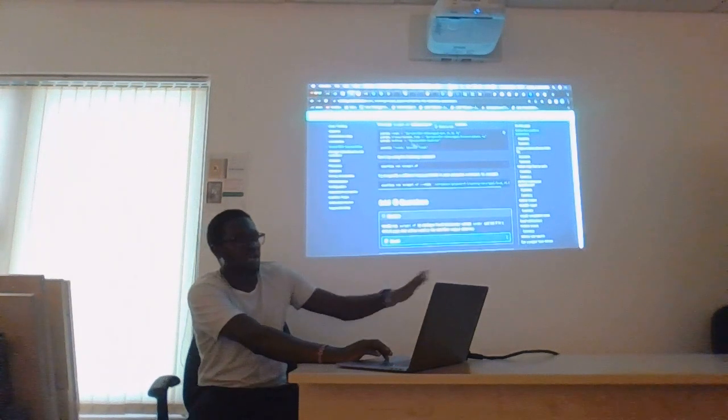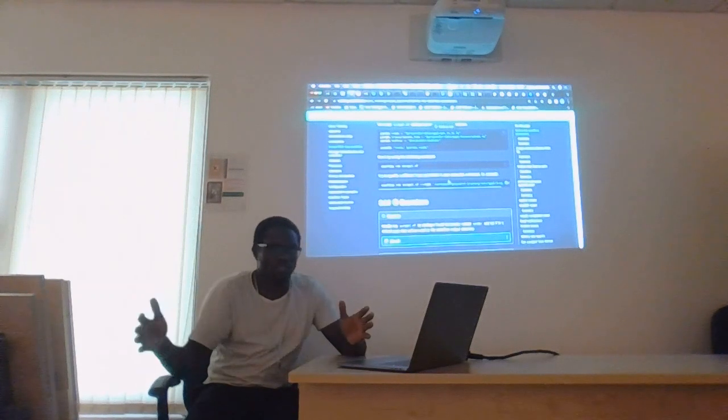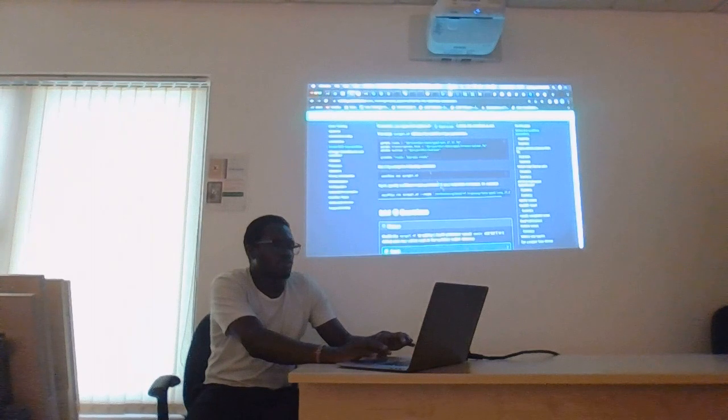Now, this was hard-coded in this script one. What if you had a different path to a different set of reads or files? Because we've already indicated that there's a parameter called reads, we can use that as an argument or as an option for your script.